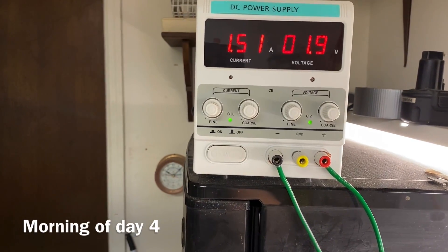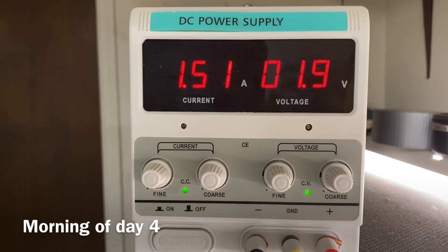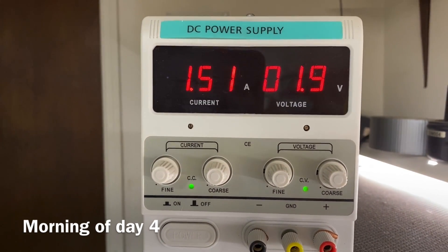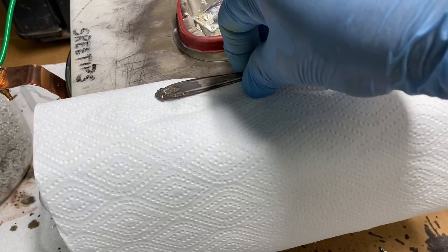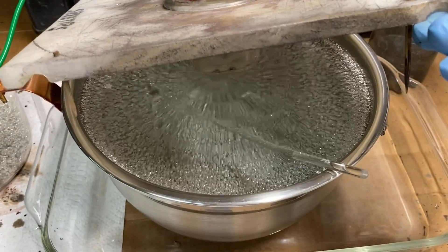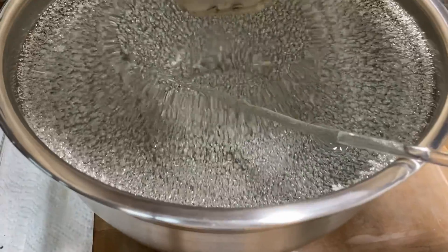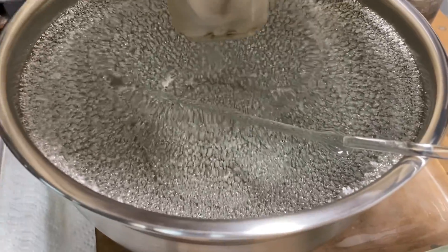Good morning YouTube viewers, Retips here. It's just after 10 a.m. and you can see the amps at 1.5 and the voltage has dropped off to 1.9. If you look down into the cell we're looking very good here. I'm very pleased with the results so far. The pure silver crystal looks absolutely gorgeous — nice uniform shape and size to the crystals.